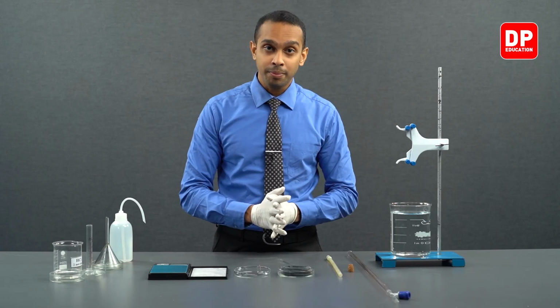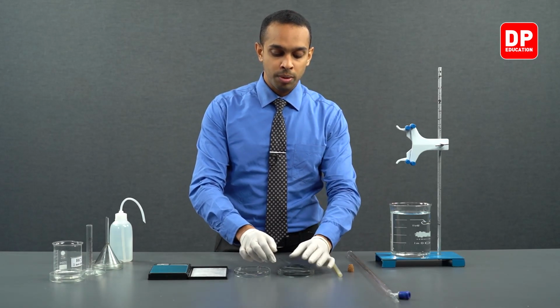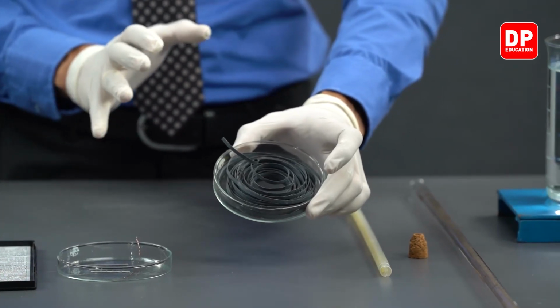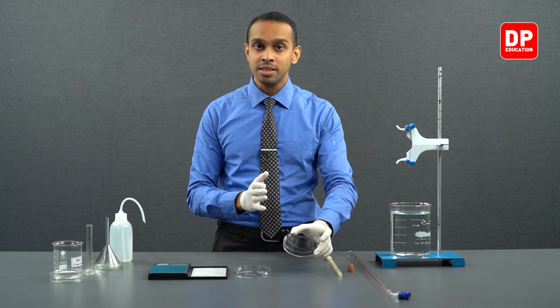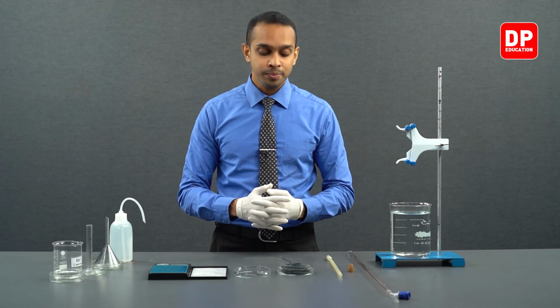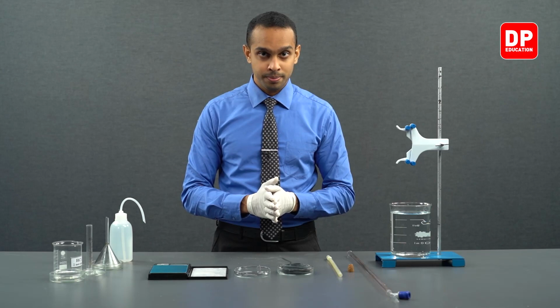Students, in the lab, we normally have magnesium in the form of magnesium strips. Magnesium strips do not appear to be shiny like other metals. The reason behind this is magnesium strips are coated with a magnesium oxide layer that makes it appear a dull gray color.